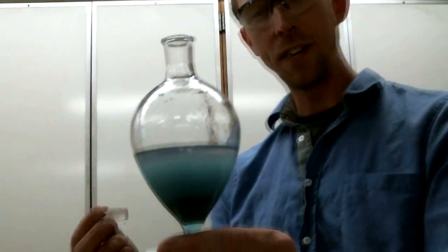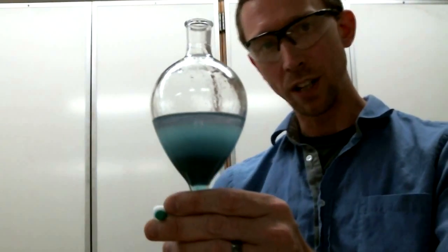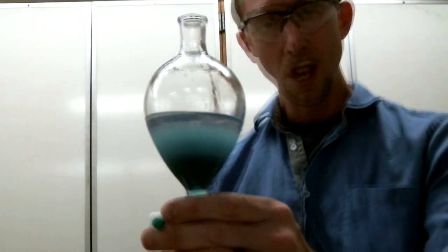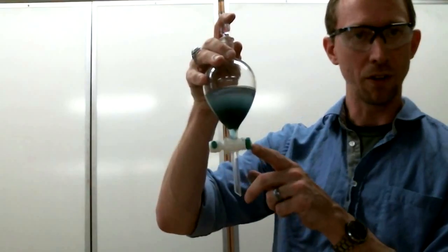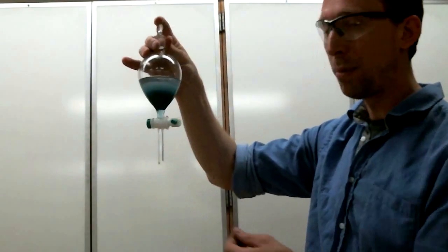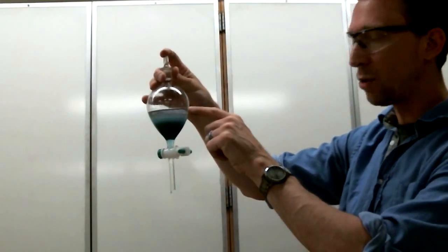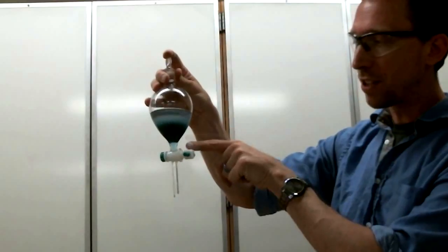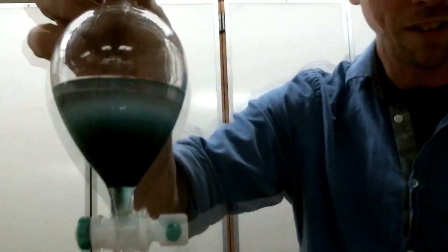And this is our evidence that these blue food dye molecules would rather be in the aqueous layer, because they're simply more soluble there. Now this is where the stem and the stopcock on the bottom of my separatory funnel come into play. If it were my goal to remove my dye molecules from my N-butanol solution, I could simply open the stopcock and drain the aqueous layer out of the bottom. Here we go, separation starting to really take effect now.